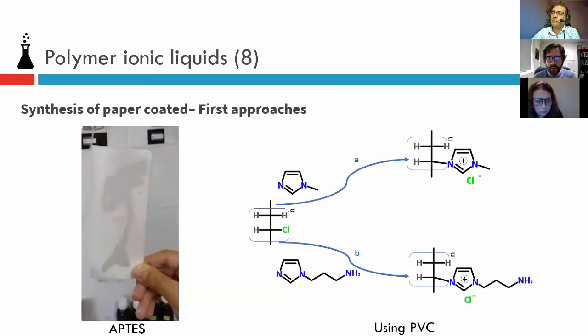This is a work that we developed with Professor Carla Toledo. I think she's attending the webinar. So we developed this work with her. The idea was just to immobilize the polymeric ionic liquid into paper.